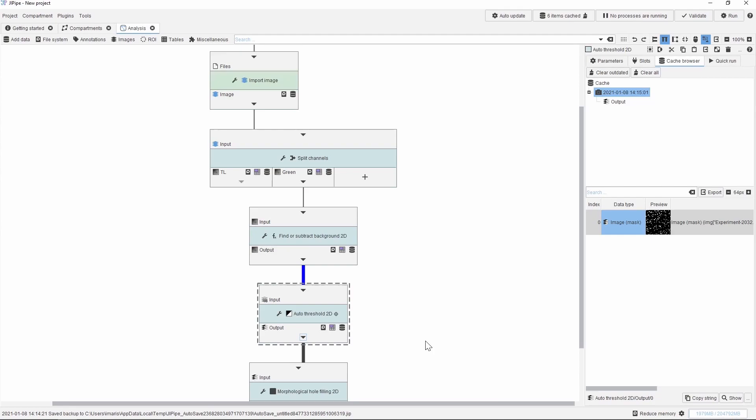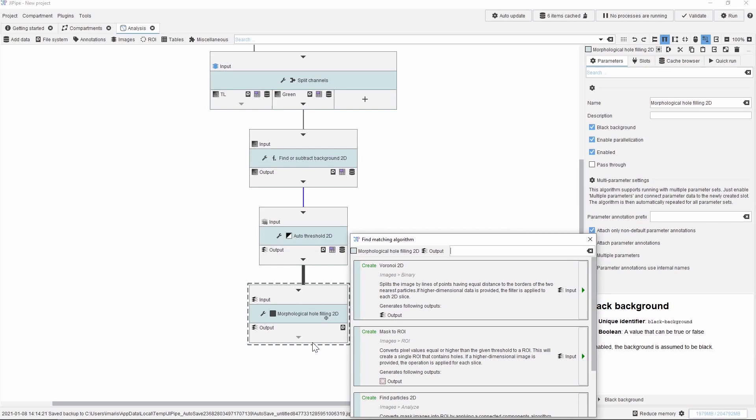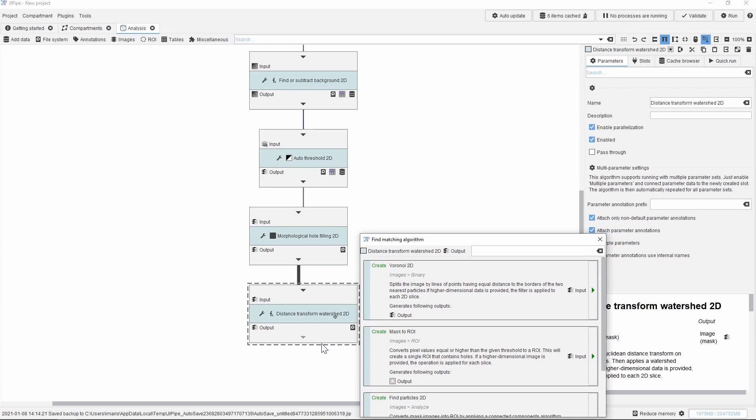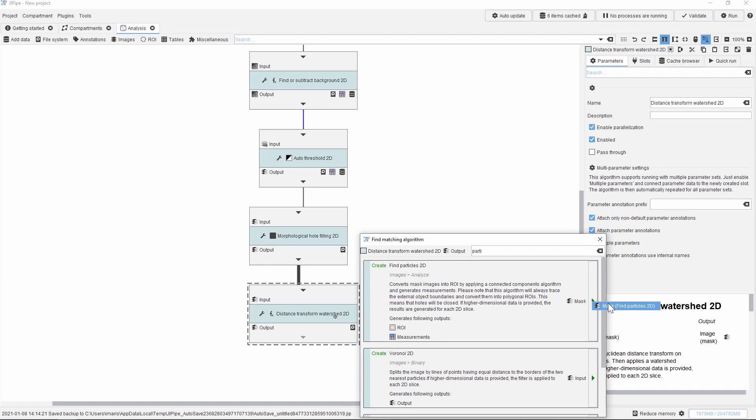Similarly we can add the watershed algorithm by a simple search. This will add yet another node to our workflow. Next we use the analyze particle function, which is called find particles 2D in Jipipe. We select that and then we set the parameters exactly the same way as we did in ImageJ, using the same values for the size and the circularity threshold.